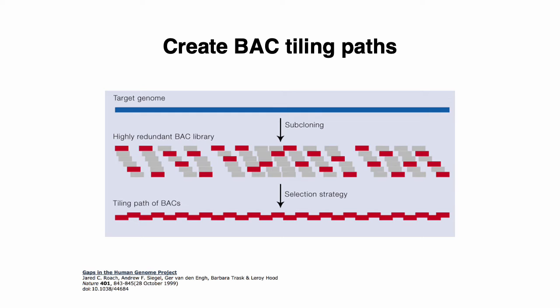And so the big picture here is that, if you start with the original genome sequence and you fragment that genome into many different pieces and generate your BAC library based on creating these 150 to 350 kb inserts and putting them into the BACs. The idea here is that through physical mapping, you can basically figure out where, broadly speaking, each insert came from with respect to the original genome.